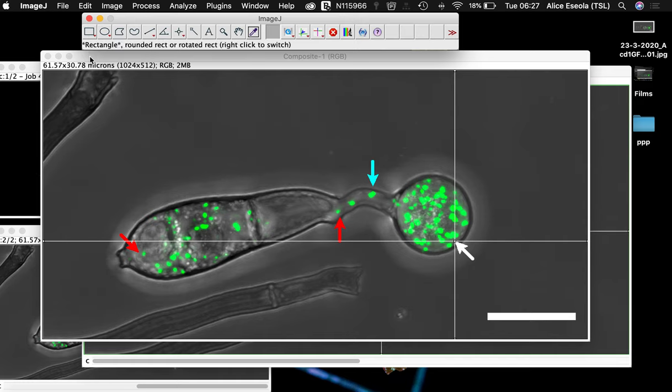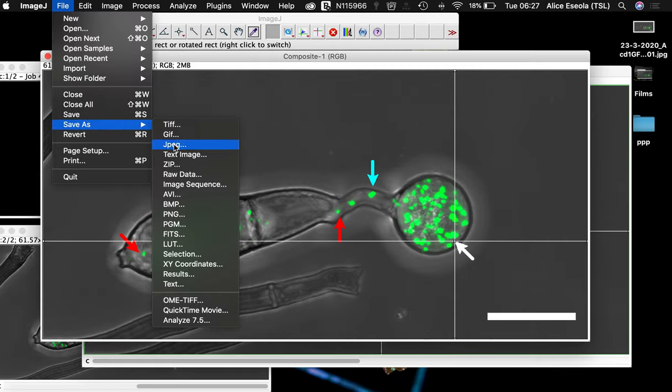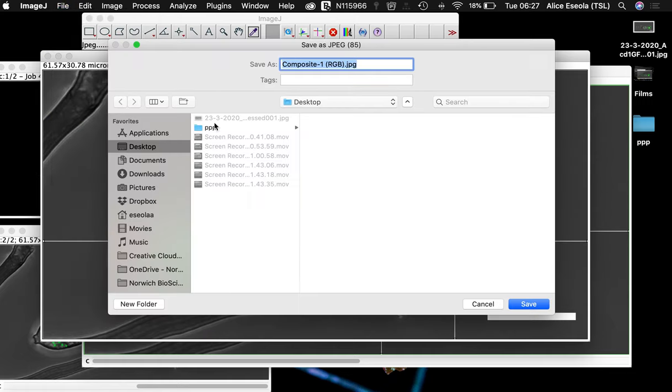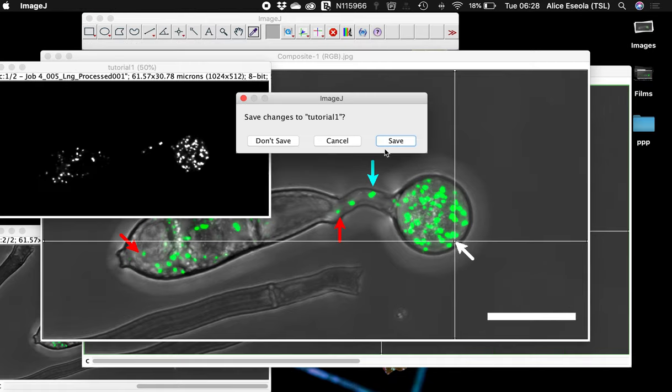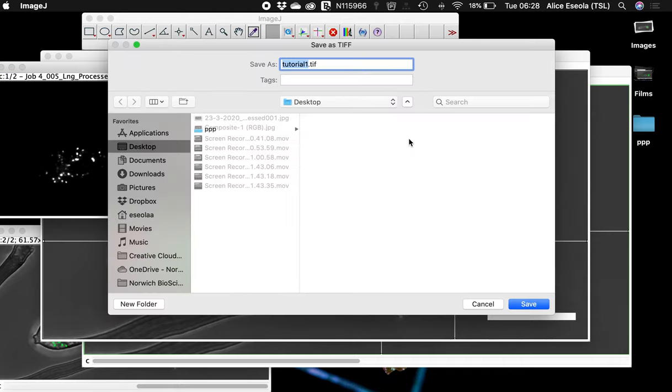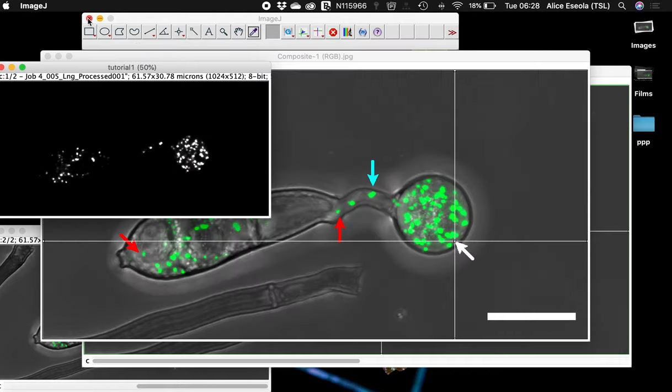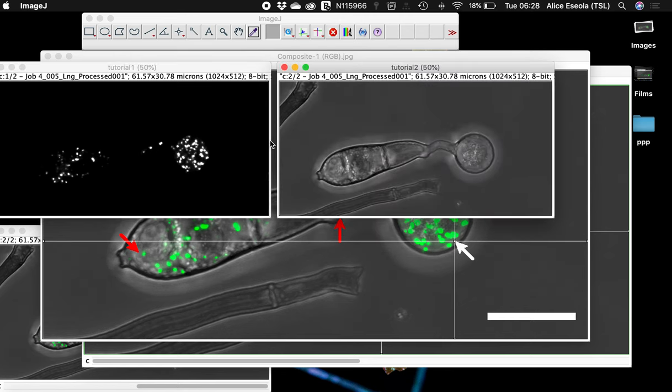Now you can save your image as whatever file format you like. I usually use JPEG. I like working with JPEG. The quality is always amazing. Now we can close our ImageJ software. I'm not going to save any of this. I've saved what I'm interested in.